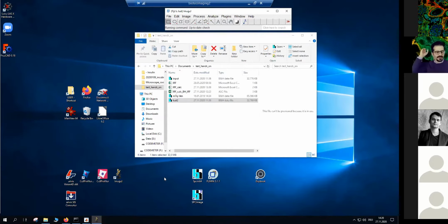Yeah, sometimes, since Fiji itself is open source and is developed and you always receive updates, that might also cause such kinds of problems. Usually it's not the case. So it's not that whenever you get an update, there is a problem. But sometimes there is one specific line in the plugin that you're using, and that might contradict one of the new updates. But I don't think that's really the case here. Mainly, the value that I'm entering for the time being seems not to be accepted by FLIM-J.